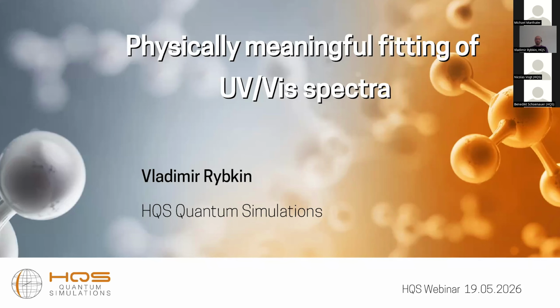Good afternoon, everyone. I'm Vladimir Rybkin from the Innovation Outreach Team at HQS. I will tell you about what I believe is physically meaningful fitting of UV spectra, which are first rescued from papers, namely from PDFs.